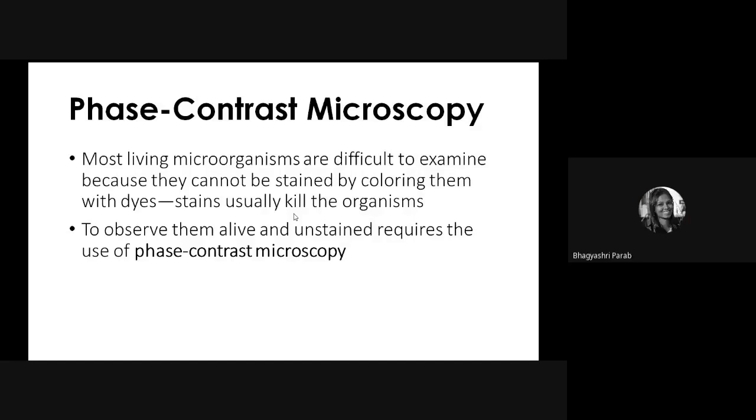Ma'am, acidic stain will be negatively charged and therefore it will not penetrate the cell because of the negative charge on the surface of the bacteria. Yes, that is correct. So what kind of stain will penetrate? Basic dyes. Basic dyes. For example? Methylene blue. Methylene blue, okay. Crystal violet. Crystal violet, yes. Methylene blue is a dye, but we don't use it commonly for staining procedures. Crystal violet, yes, most commonly used example.